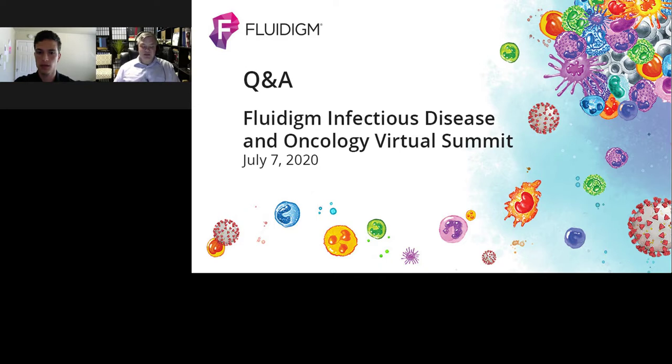We also have some nice functionality where, if you have a group of data that all needs to be gated in the same way, you can save predefined gating positions. So as you move from one group of data to another, even though it's not being automatically gated by some sort of artificial intelligence, predefined gating positions are allowed, and it should make things pretty straightforward for doing any sort of analysis.